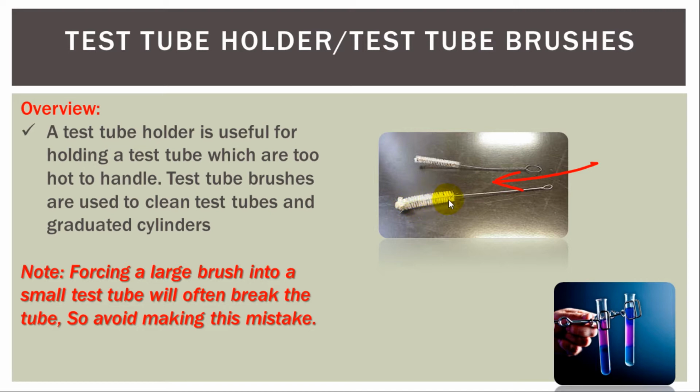And make sure never to force the large one in, because these come in different sizes, so you always want to make sure you have the right test tube brush for it. Don't try and force it in, because you could break the glass by doing that. It's happened many times, so try not to do that. Just eye it and see, oh, this is the right size. If you're not sure, ask your instructor. I'm sure he or she would be happy to tell you which one's the right one, but make sure you don't put the wrong one in, because it could break the test tube.